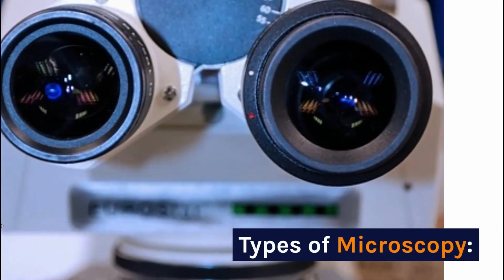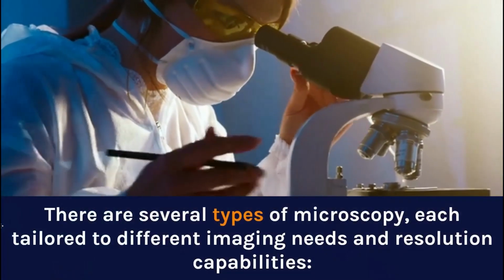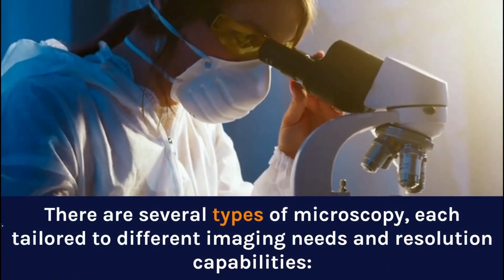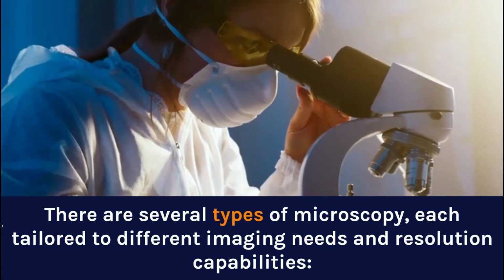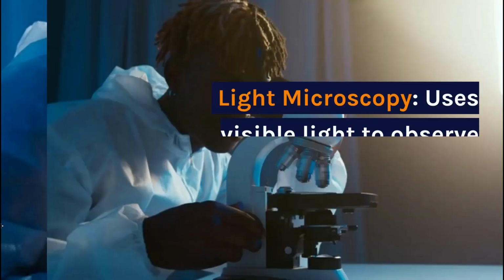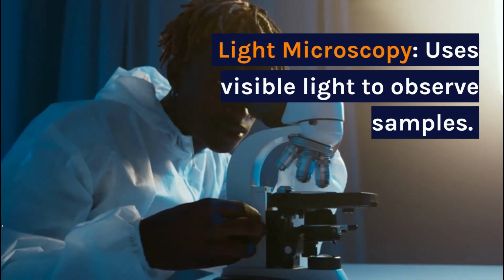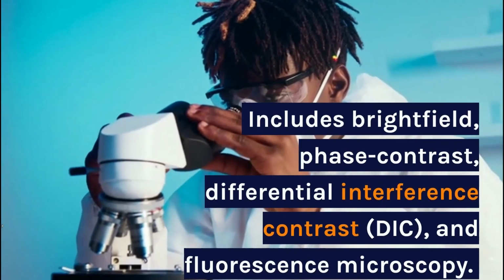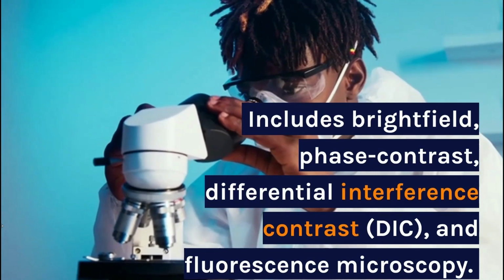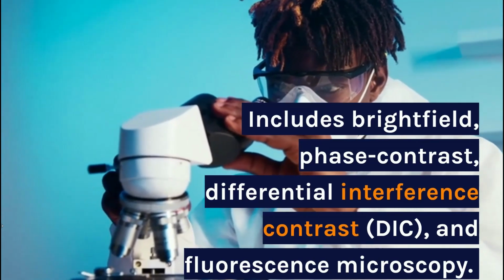Types of microscopy. There are several types of microscopy, each tailored to different imaging needs and resolution capabilities. Light microscopy uses visible light to observe samples. It includes bright field, phase contrast, differential interference contrast, DIC, and fluorescence microscopy.